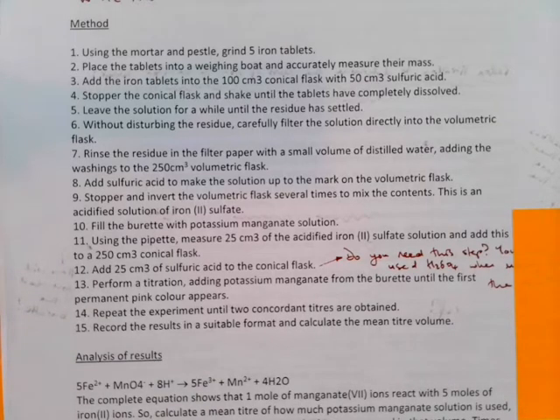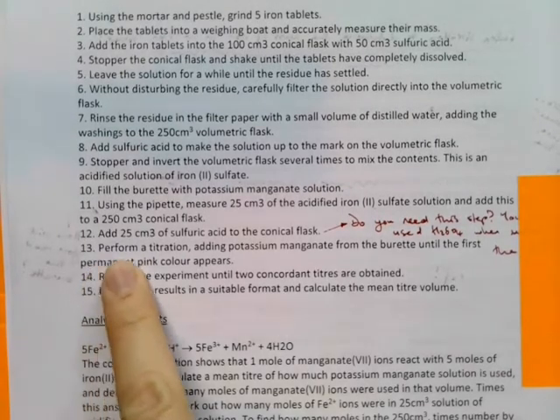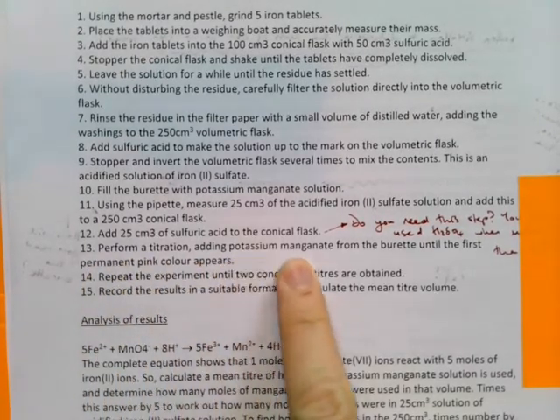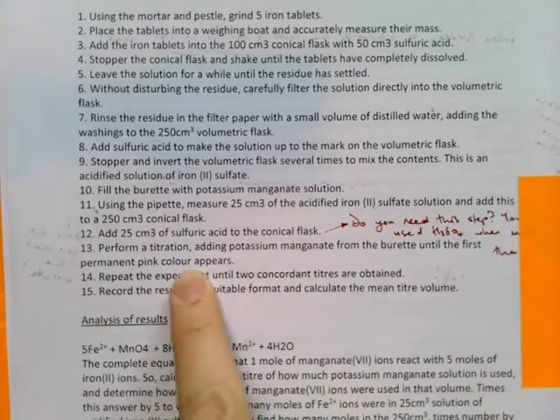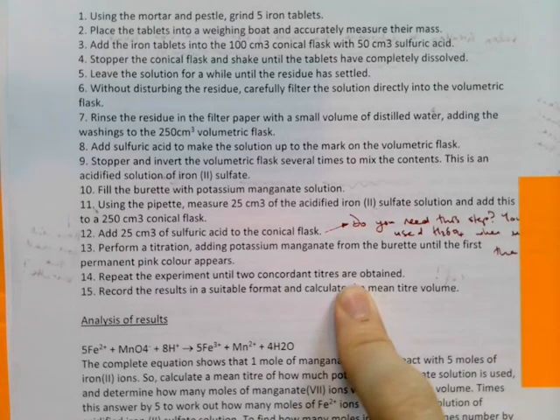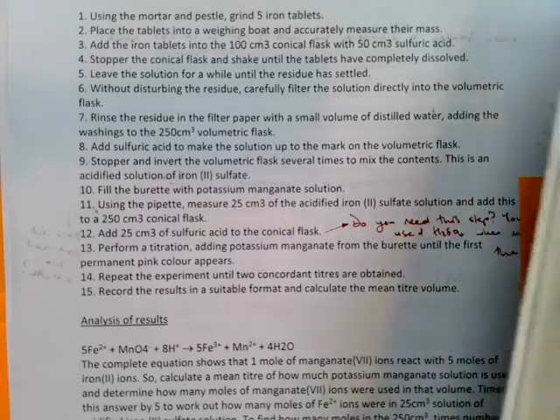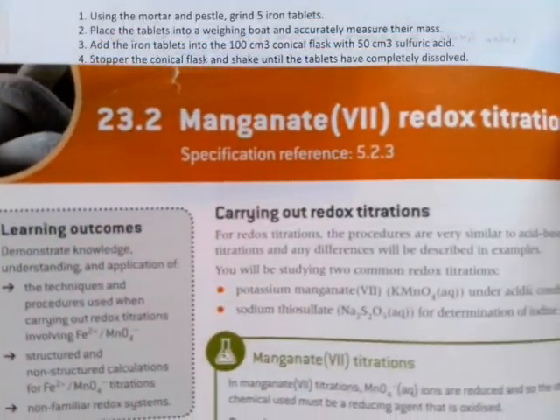So the first thing that almost everybody didn't have was the issue in the experiment when you perform the titration, adding the potassium manganate from the burette until the first permanent pink colour appears, and then repeating the experiment until two concordant titers are obtained. Nobody mentioned anything about how you measure the amount of potassium manganate in the burette, which suggests to me that nobody actually read about it in the textbook. So in the textbook, it's chapter 23.2. It talks you through exactly how to do this titration.